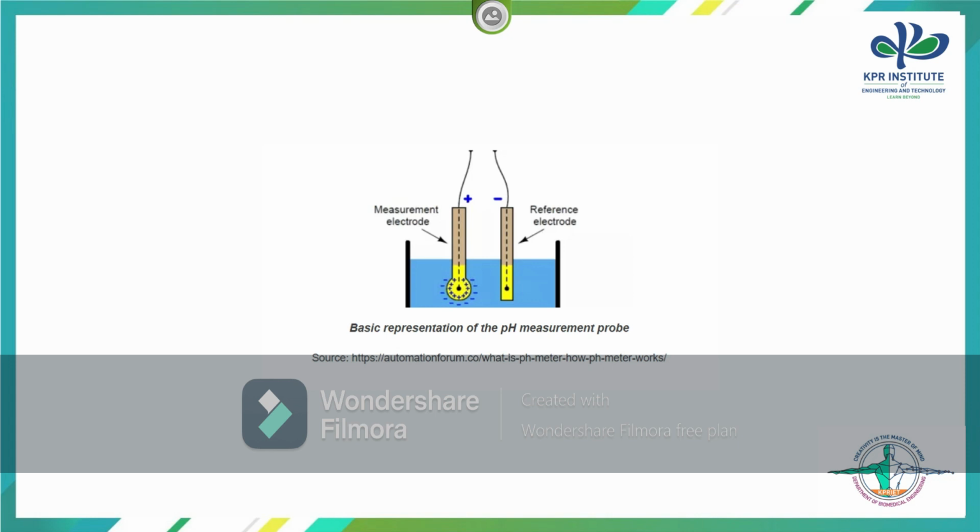The pH meter is a pH responsive electrode which measures the hydrogen ion activity in a solution and conveys the information to a voltmeter. The equipment consists of two glass tubes, each containing one electrode. The reference electrode is made of saturated KCl solution, whereas the sensor electrode contains a buffer solution of pH 7, and a silver wire coated with silver chloride is immersed in both these solutions.